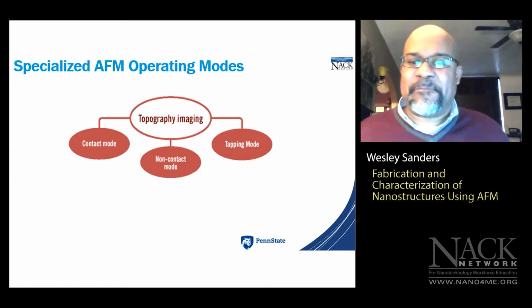Is there any kind of operation like this where you don't use the atomic force microscope and you just use the laser, like in the liquid, where you get a much finer or higher resolution with just using a laser light to make your image rather than using the atomic force microscope?